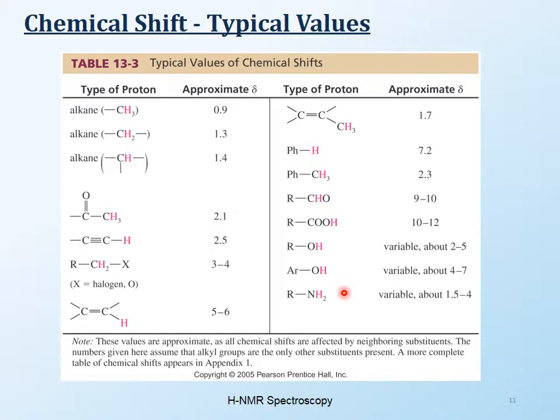There are some things that are very key in identifying an NMR spectrum, but just like you saw in the previous slide, that adding one chlorine can change the chemical shift so much, there is no point in memorizing any of these numbers, okay? Because if you add a chlorine or a bromine or a fluorine to a compound, it will change the chemical shift, all right? But these are some of the typical values where you can actually find these protons. And so in some cases, you can get a general idea, okay, if you have a very typical kind of a compound with no major electronegative elements in there.